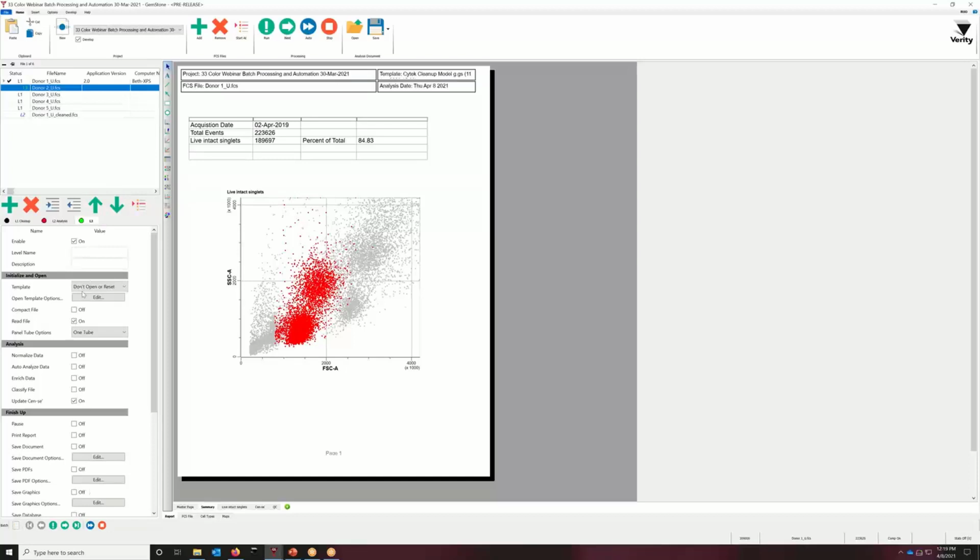All of these batch tools are then ready to be programmed, and they're active. So you can go ahead and type in a new name, you can add a description, and then you can start adding another template, just programming it down using all of these batch command tools. There are no limits to the number of levels that can be created. And each level is pretty much independent of the other level unless you designate otherwise, such as for first tube and subsequent tube merging files, etc.